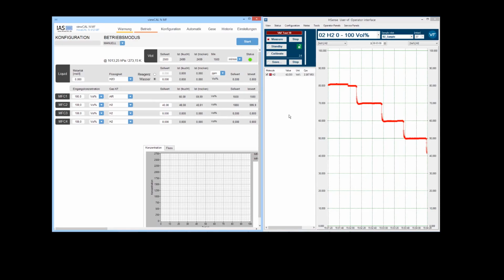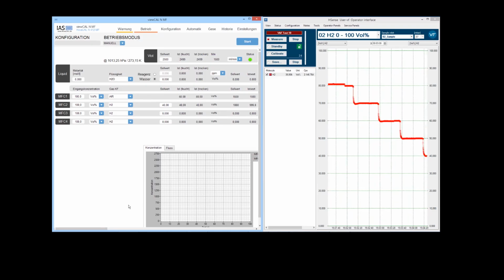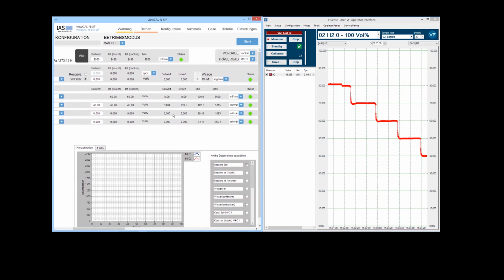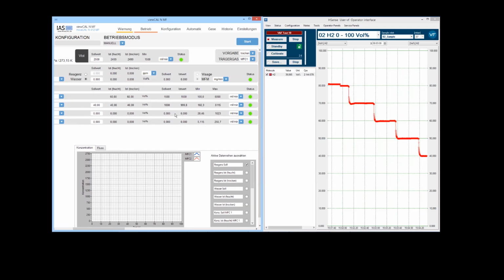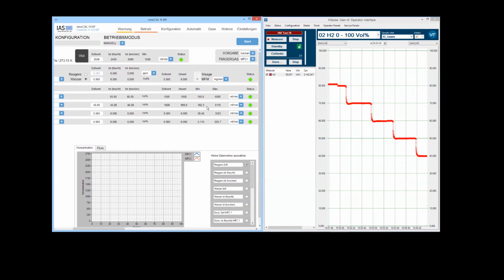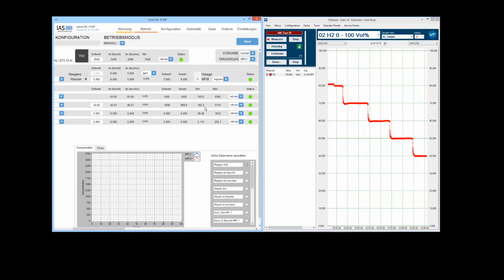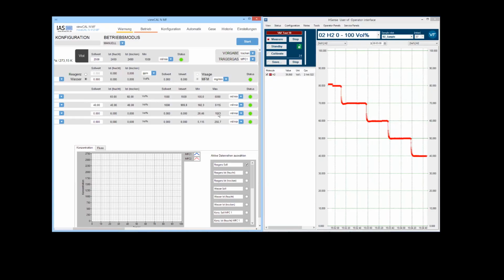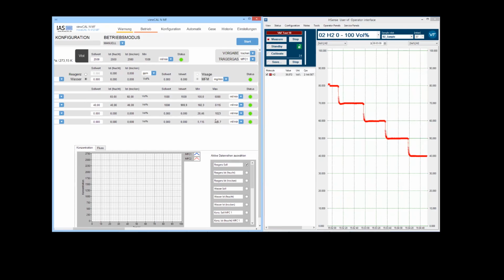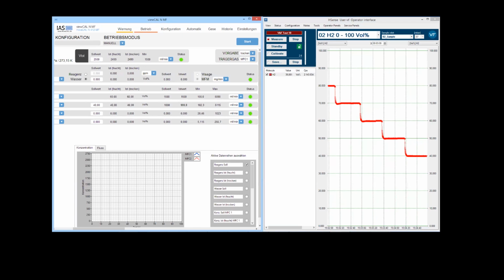So we're going to continue on. And one thing to keep in mind, if you're using mass flow controller based dividers, is that all of our mass flow controllers carrying the hydrogen have a certain range, which means there is a minimum and maximum flow rate that they can output. Once you reach the edge of the mass flow controller on the lower side, we switch to the next one, because this one can go further down and this one can go even further down. It's just the difference in maximum and minimum flow that we have for each of the mass flow controllers.